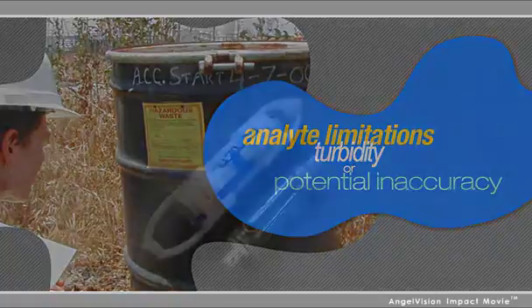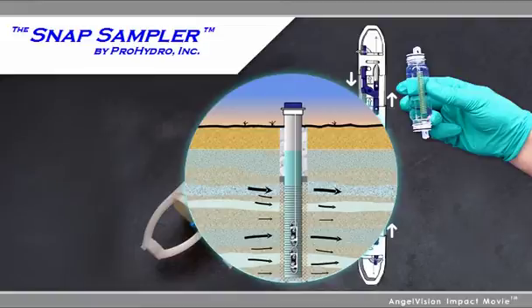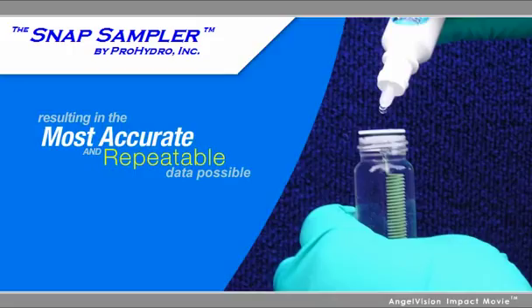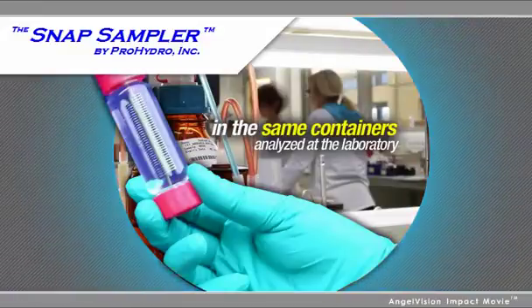The Snap Sampler uses a unique system that seals groundwater samples in situ with no headspace vapor and collects samples from the exact same depth every time, resulting in the most accurate and repeatable data possible. The Snap Sampler is the only method that seals your samples down whole and remains sealed all the way through lab analysis.